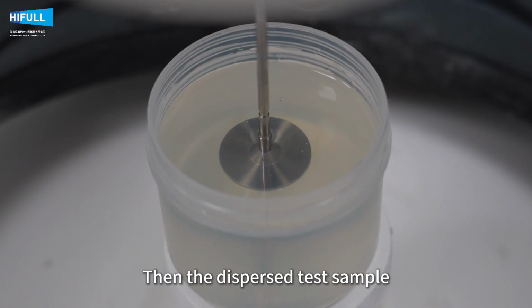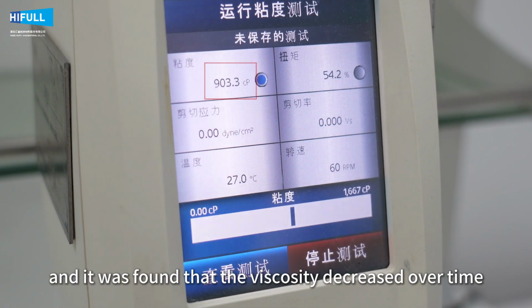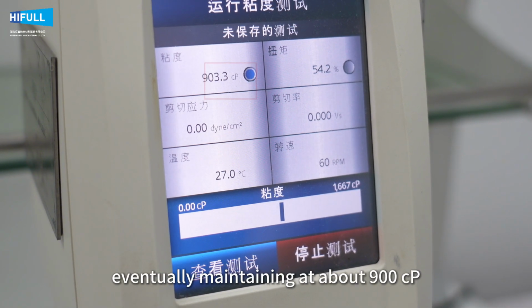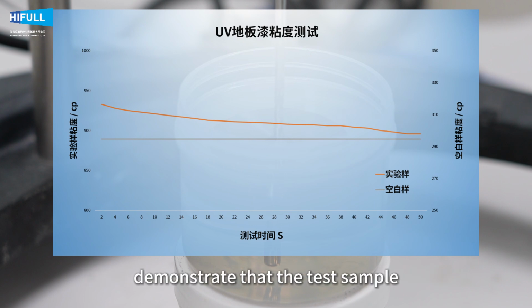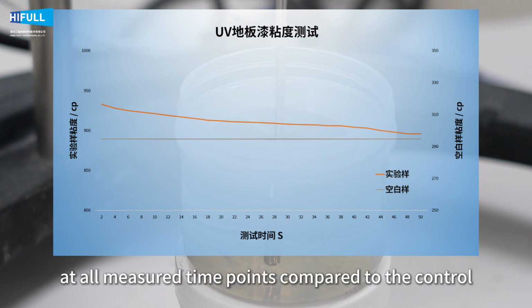Then the dispersed test sample was measured under the same conditions, and it was found that the viscosity decreased over time, eventually maintaining at about 900 cp. The plotted viscosity time curves, with both samples in the same reference chart, demonstrate that the test sample consistently exhibited significantly higher viscosity values at all measured time points compared to the control.